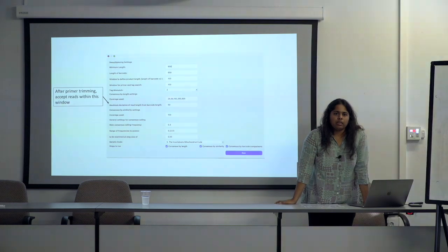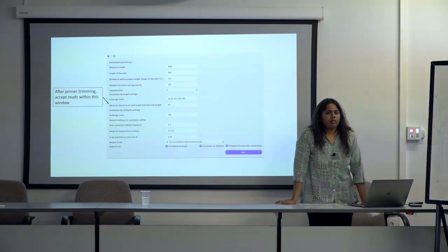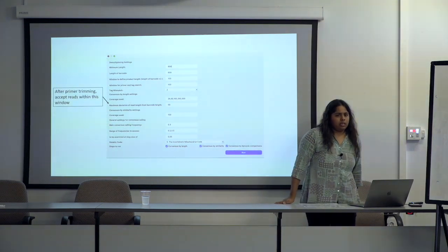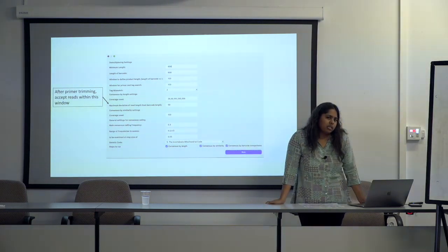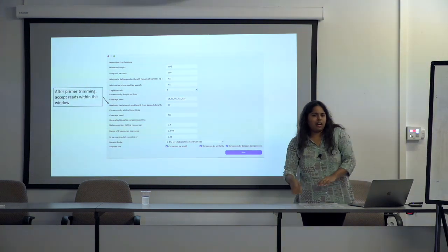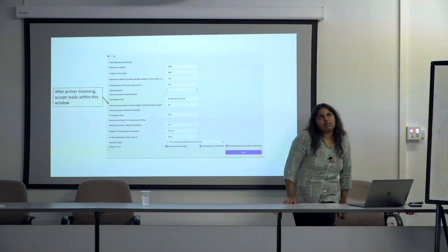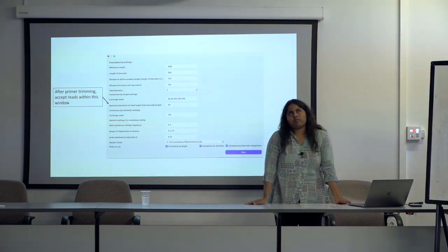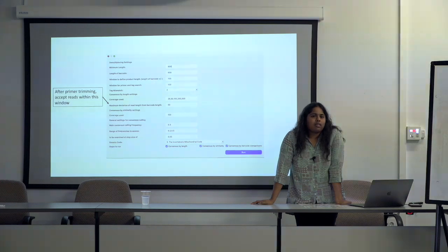Are there different default settings between Mac and Windows? I just have a different number of barcodes obtained after reads. How much is it? 9. Ah, okay. I think that can be a bit random, because the read selections may not be identical, because the subsetting may not be identical. So there is that little minor randomness between runs. It will vary, something like 3 or 4 barcodes sometimes.